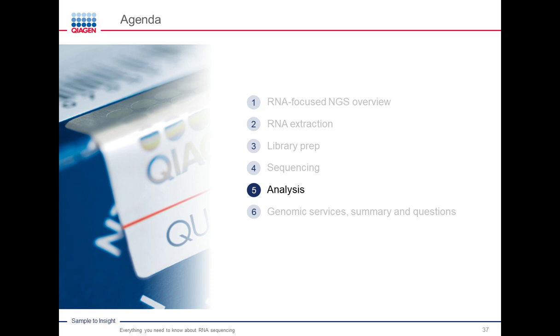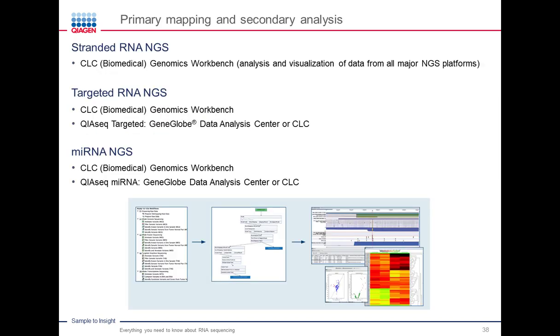So what I always typically look for is prepackaged analysis solutions that basically enable you to move your lack of expertise aside and allow the bioinformatic experts to analyze your data. And a lot of times you can actually do this on your own using pre-designed pipelines.